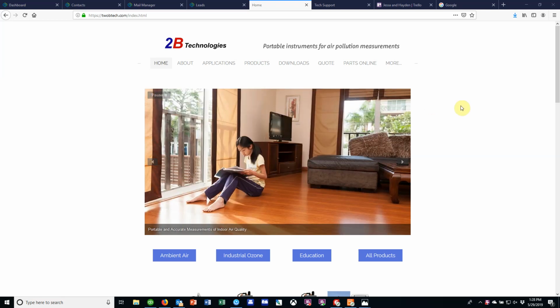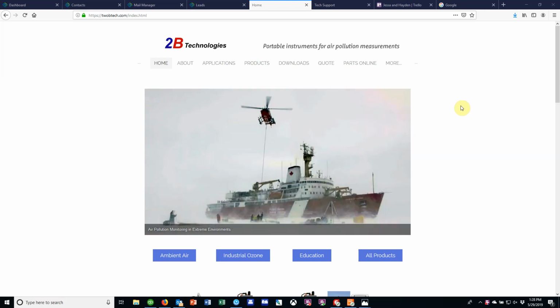Hello, my name is Hayden Overman, and this video today will show you how to use our 2B data display and graphing software to transmit data from any of our instruments.